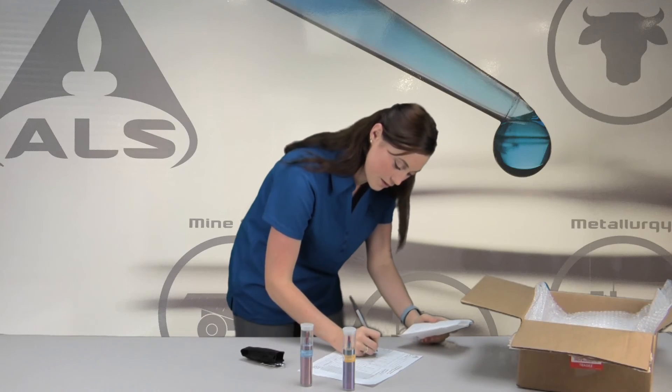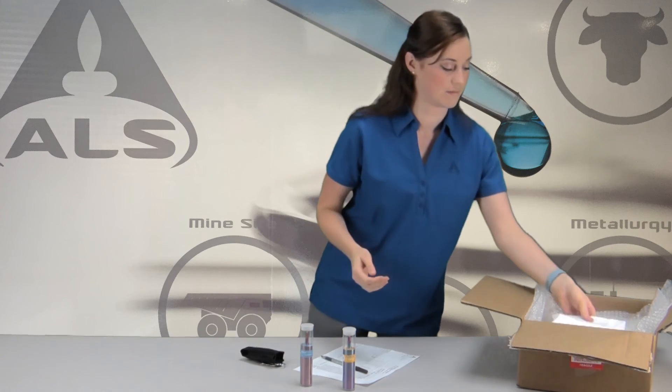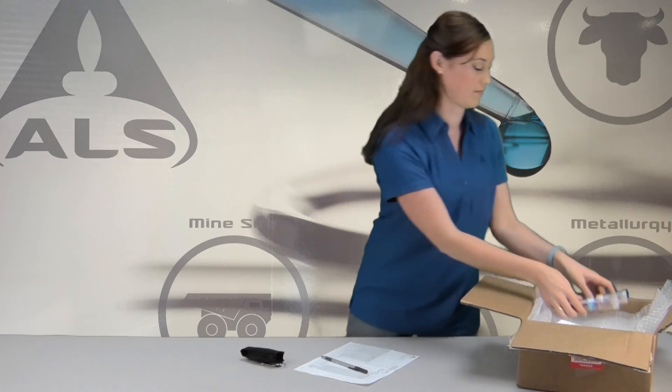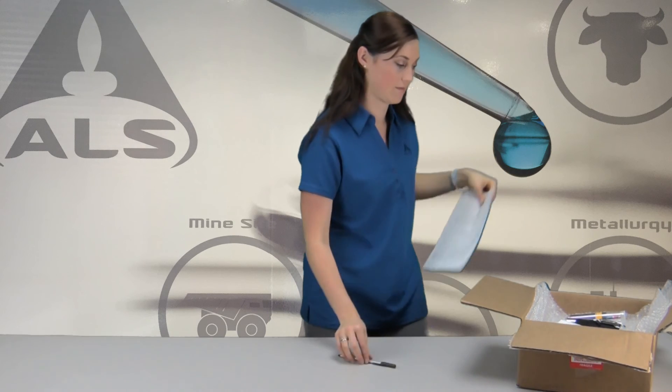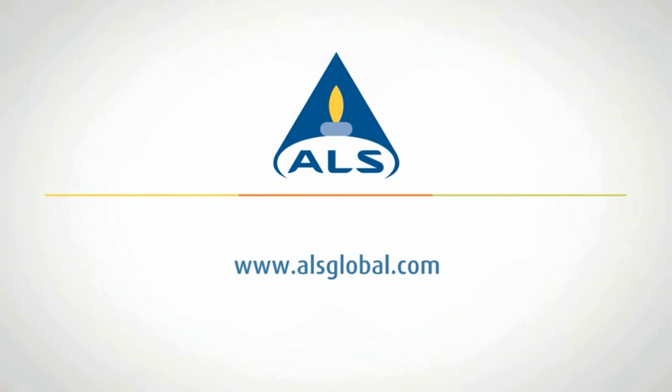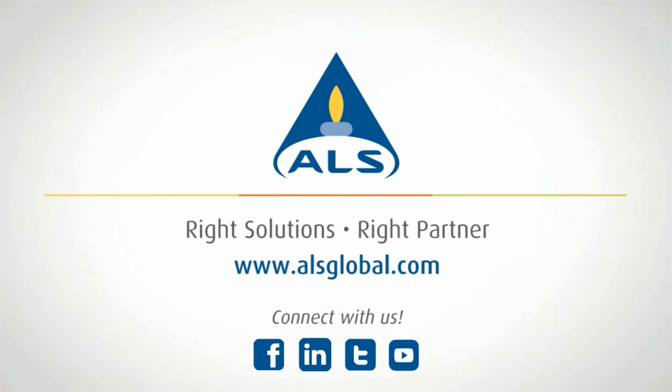Record the duration of the sampling event on the chain of custody form. Send the HDS personal monitor, the pressure gauge, and the completed chain of custody form to the laboratory for analysis. For additional information, please visit www.alsglobal.com or contact your ALS project manager.